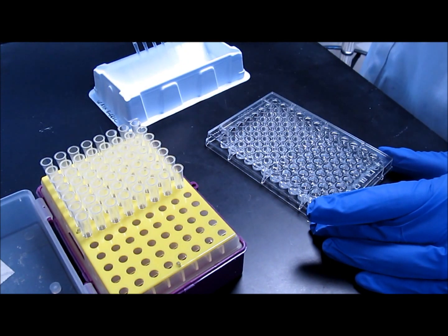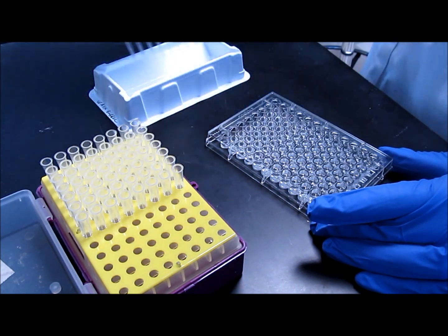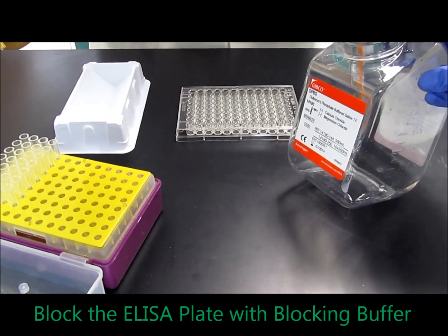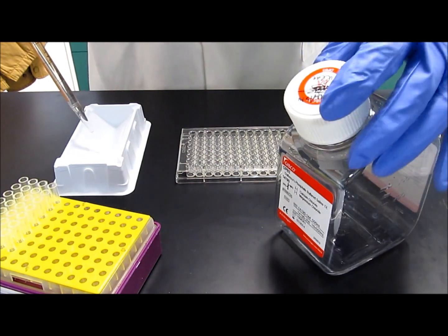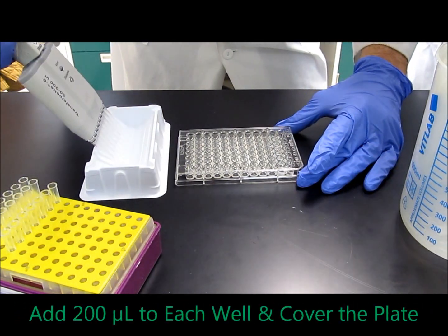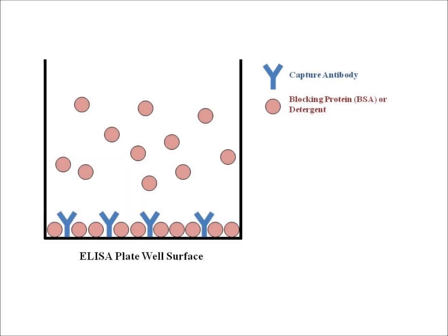From now on, we're just going to tell you that you have to wash after each step. After having washed away all of the residual capture antibody from the ELISA plate, the final step is to add the blocking buffer. Just like we put 10 milliliters of PBS into the reservoir when we made the capture antibody, you're going to take the blocking buffer, put it in the reservoir, and pipette it into each well. Then wrap it in plastic wrap, and you can put it in the refrigerator overnight, or leave it at room temperature for two hours. This is sufficient to allow the blocking buffer to fill up any remaining space between the capture antibody.